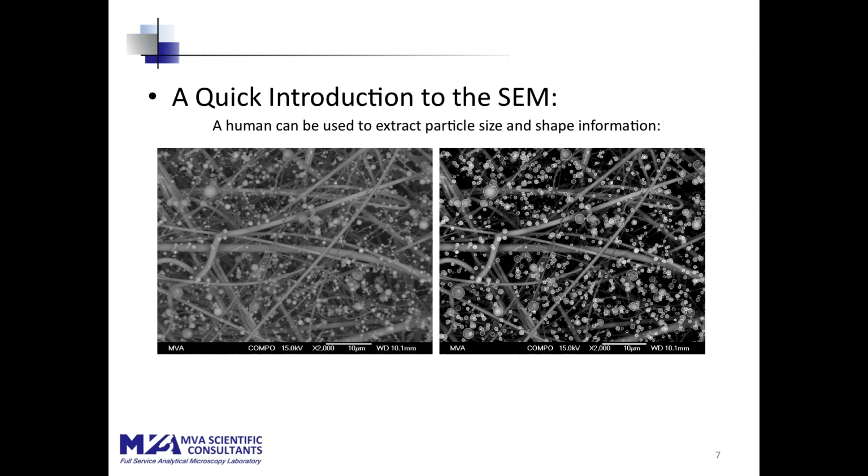Unfortunately, for the particles on a glass fiber filter or a quartz fiber filter, we do not have software as yet that can recognize particles against the background of the filter. However, people are excellent image processors, so someone can sit with that image and outline the particles in the image and record that to software, which can then perform the same sorts of calculations of two-dimensional morphological parameters.